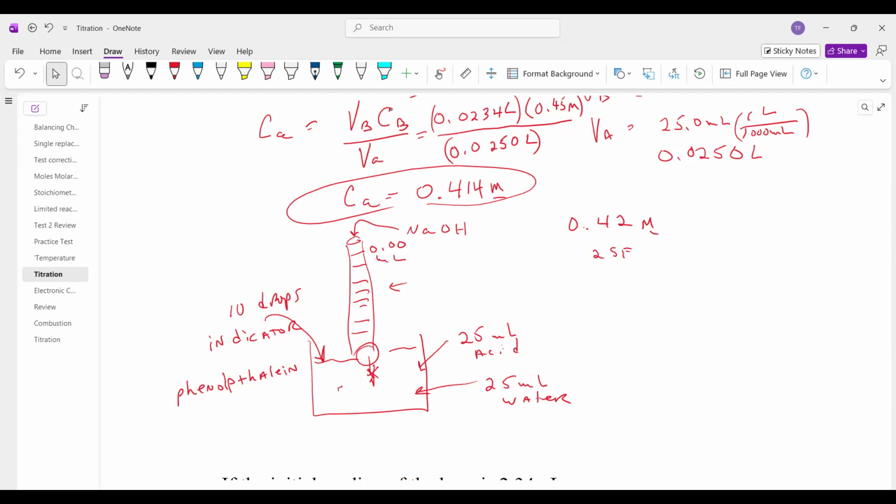Now, lab 15 is to determine the unknown concentration of the base. And then using that for lab 16, we're going to titrate and see the concentration in milligrams of the vitamin C tablet. So this is going to be your most comprehensive lab of the semester, these two together. That's one reason it's at the end. You're bringing all these concepts together: solutions, concentrations, acid-base neutralization.